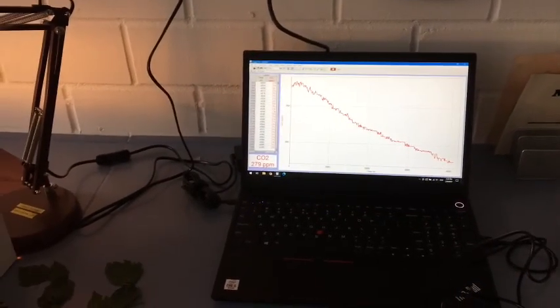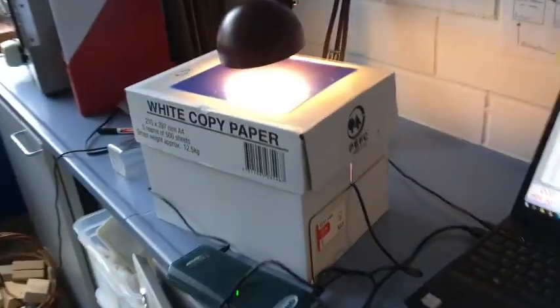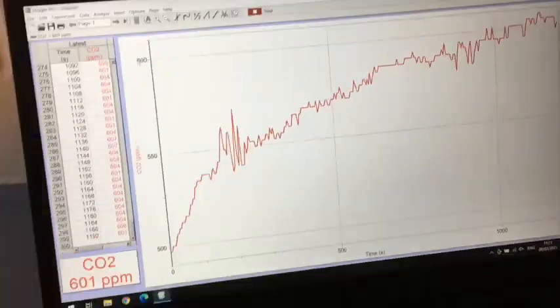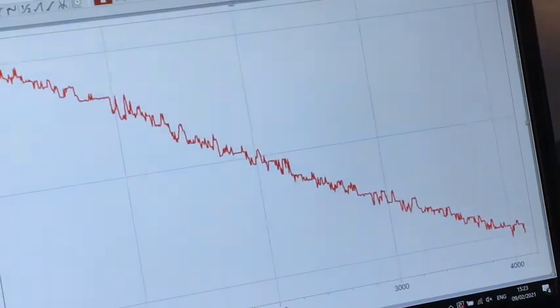All right, now this is very weird. The red is going down as expected, and I'm using transparencies now. This is printed on a transparency. You really can't even see in there. This is the blue. The blue should be going down because it should be photosynthesizing. Instead, it's going up, so that doesn't make any sense. The green should not be photosynthesizing. However, it is still taking in carbon dioxide. I don't think it's very green, so I am going to put an extra set of filters on in this next round and see what happens.